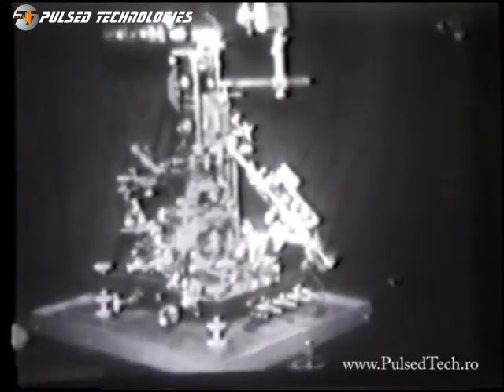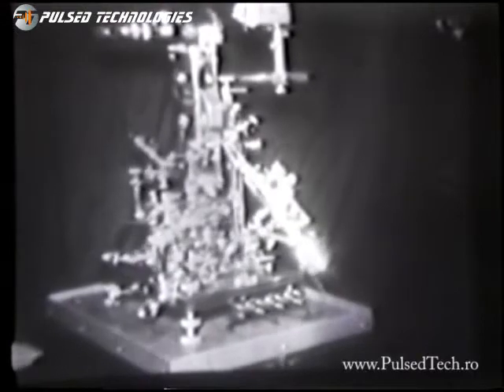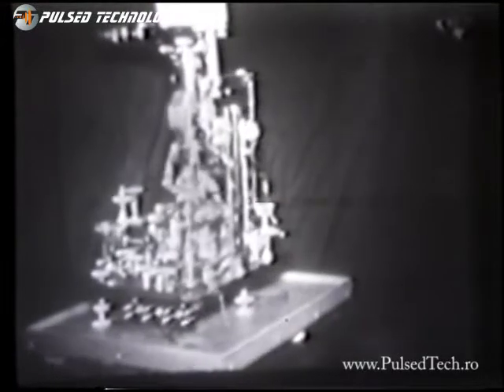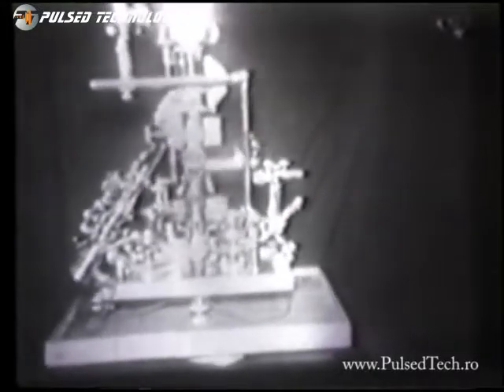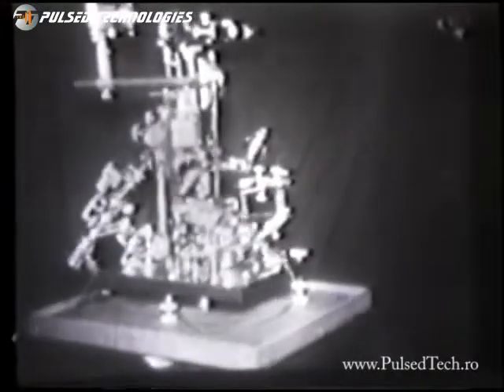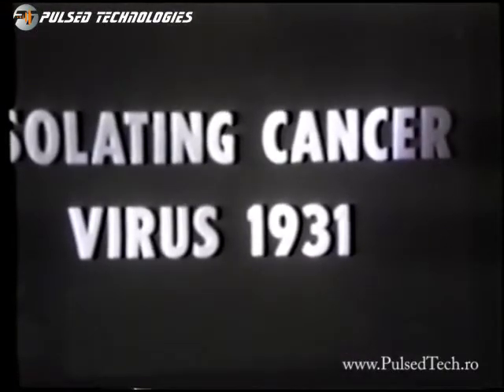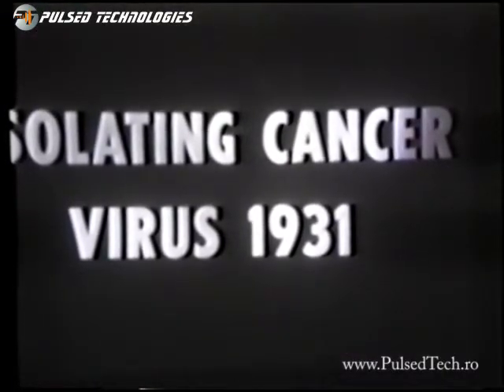That embodied all fields of microscopy, including dark field, polarized light, infrared light, ultraviolet light, and monochromatic beam light. The indicator dial moved around 7 times to move the object up and down 1 micron, and it was a very sensitive instrument. The ocular that you see on the left side in the middle of the instrument, when that was plugged in, made it a standard microscope.